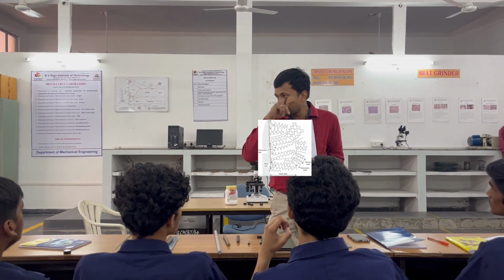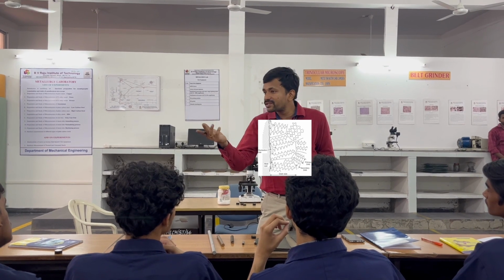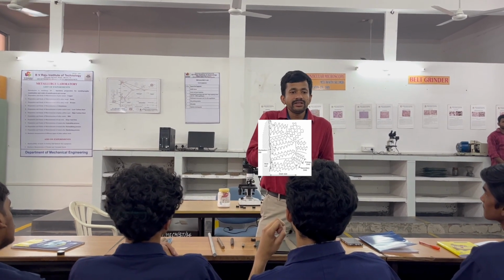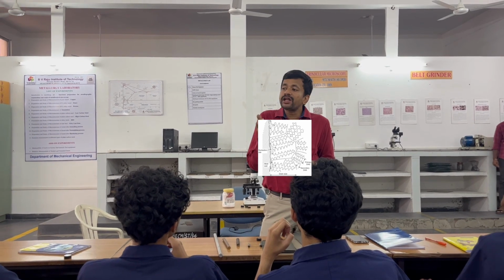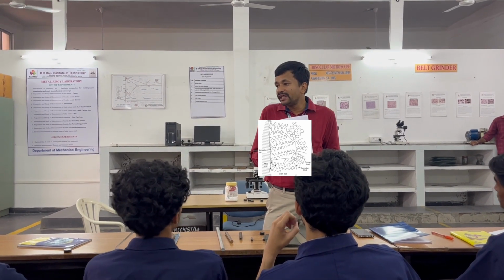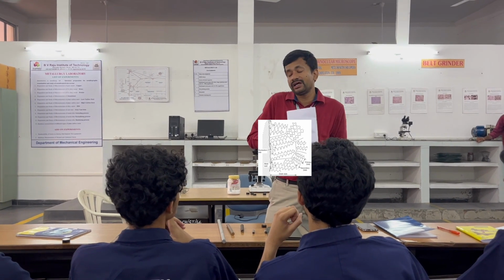Dendrites are like broken needles and snowflakes, more like snowflakes. So these dendrites are nothing but a collection of atoms growing in a particular direction. Now as the temperature cools down further and further, there will be many such nuclei growing towards dendrites.